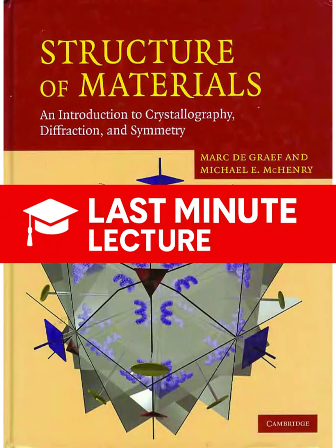It does more than that. The electrons are subjected to an enormous electric field, and their potential energy, Ep = eV, is converted directly into kinetic energy, Ek = 1/2 m v^2. That's where the high velocity comes in. I saw a number in the source that for a potential of just 10,000 volts, these electrons are moving at approximately 59.3 million meters per second. That's right. That's almost 1/5 the speed of light.